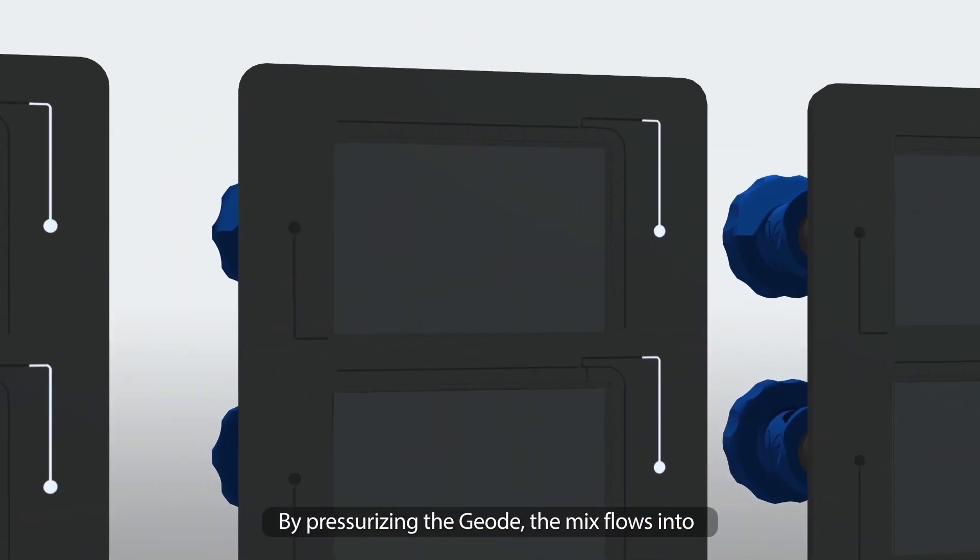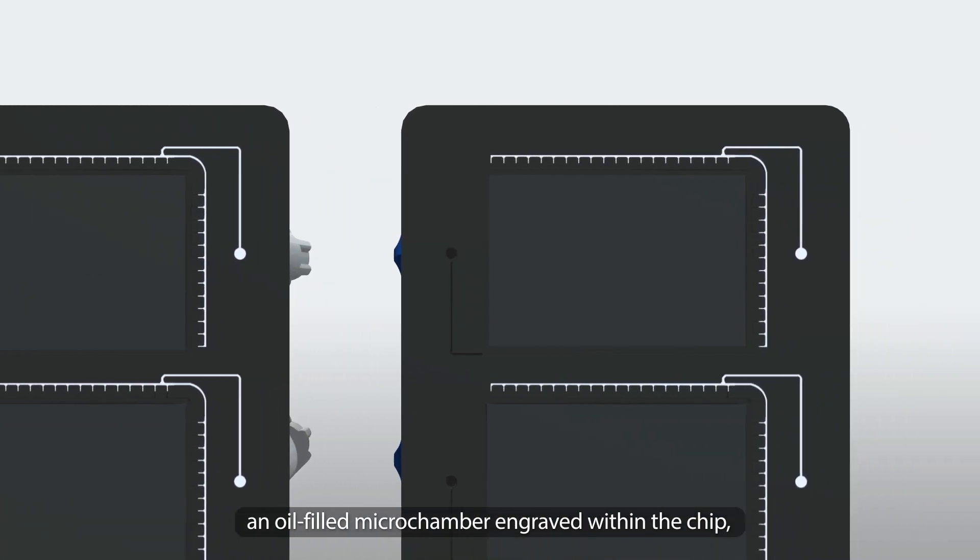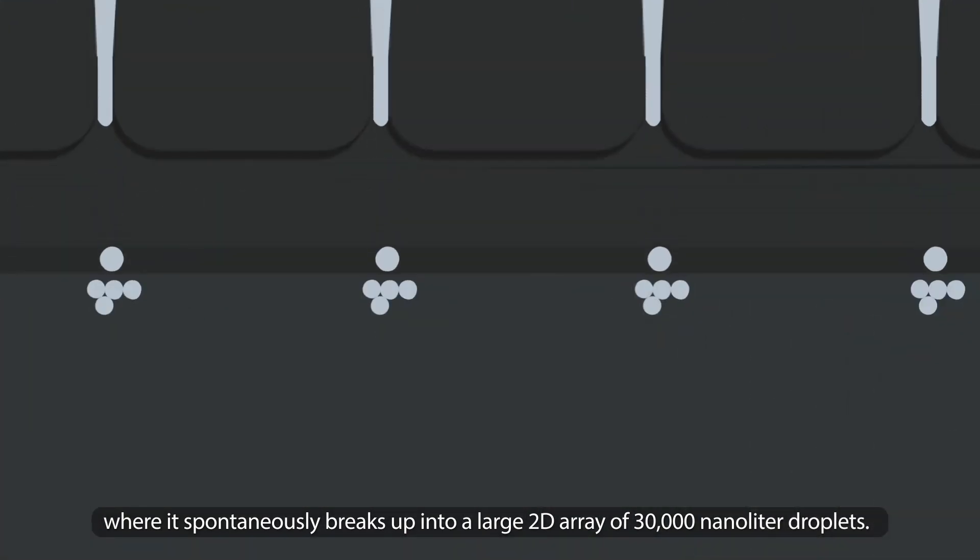Close the lid, click play and walk away. By pressurizing the geode, the mix flows into an oil-filled microchamber engraved within the chip, where it spontaneously breaks up into a large 2D array of 30,000 nL droplets.